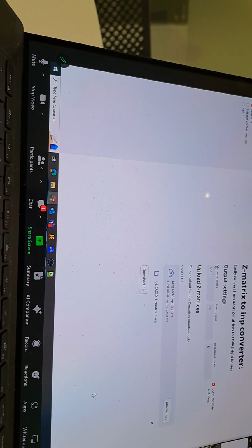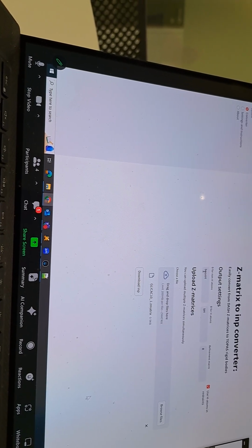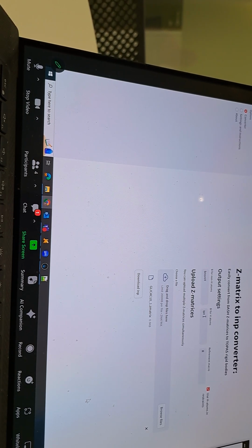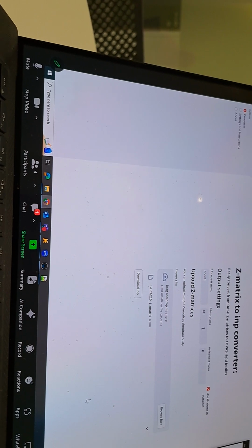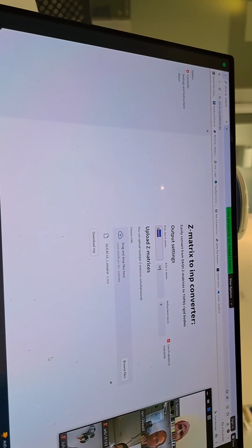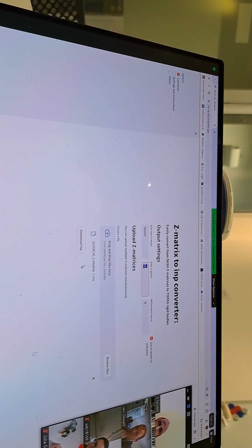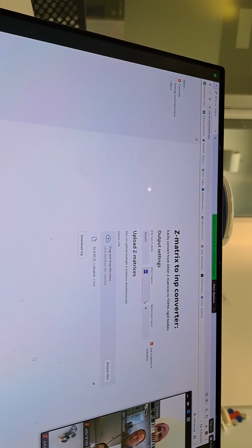That's the ADP, your thermal parameter for your system. So that's the powder diffraction term for ADPs, or your isotropic temperature factor, and that for your hydrogen. They're going to be slightly different from one another. You could define just one, and then multiply this one by 1.5, which is what single crystal refinements do. But we can change this if we want.